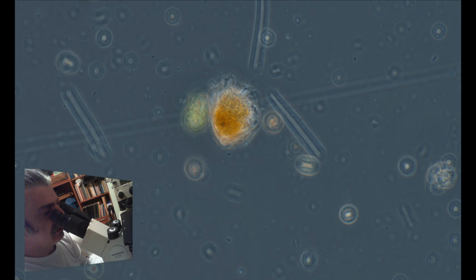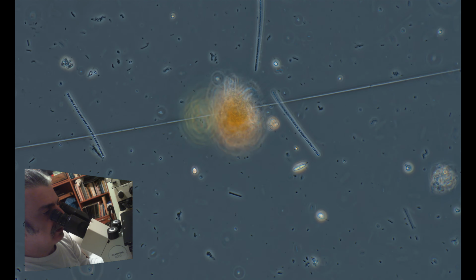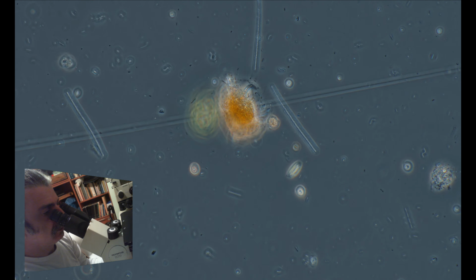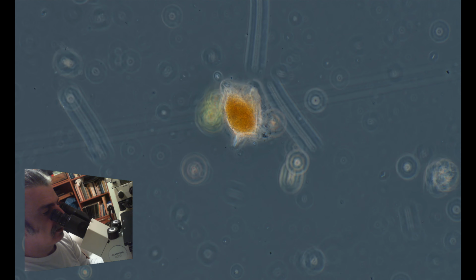So with phase contrast we can see the orange body, and on the bottom of it we can see the pseudopodia, the so-called legs that the amoeba uses to move around and stretch.